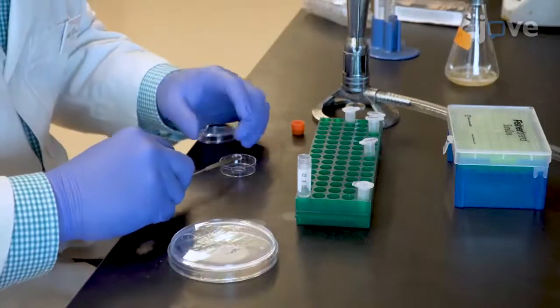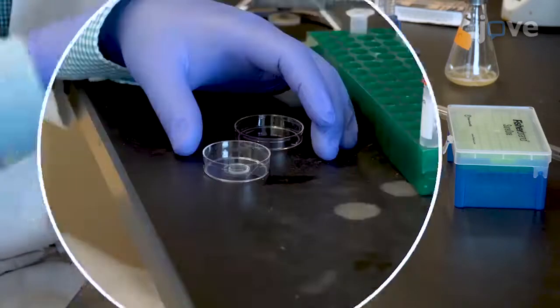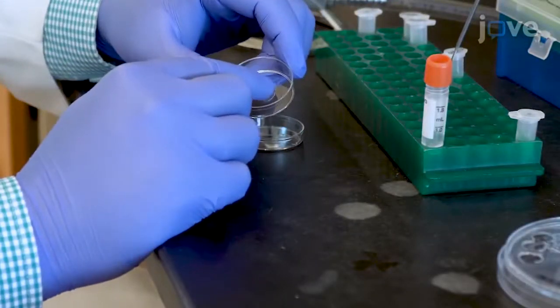Place an 11 millimeter diameter agarose slab over the sample and gently tap to make sure the slab is flat against the cover slip.